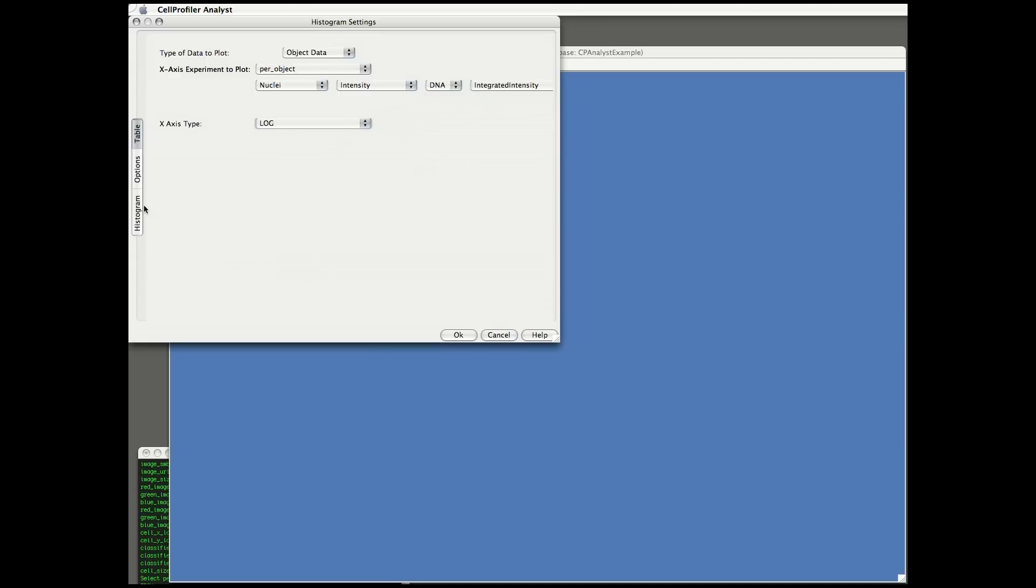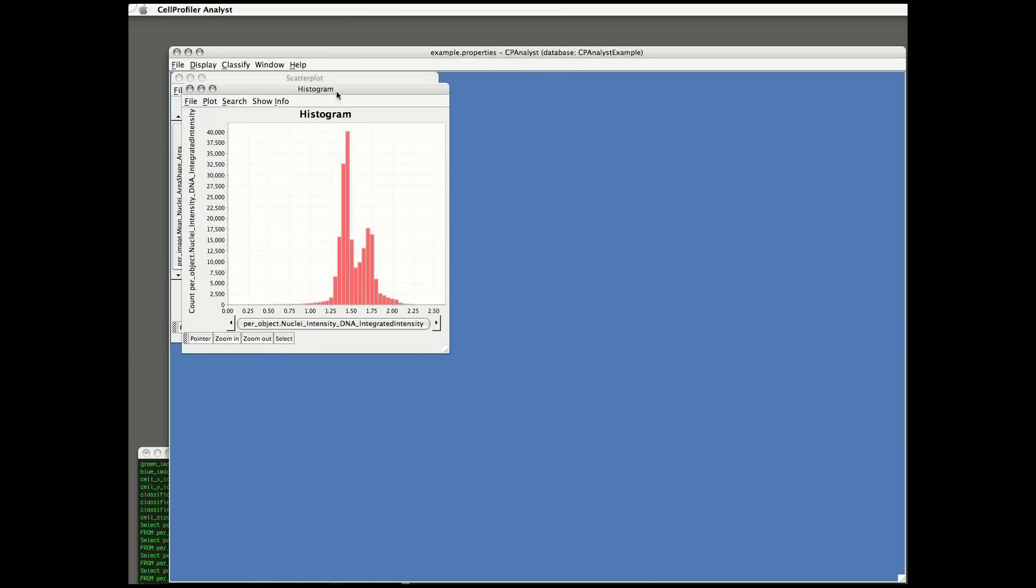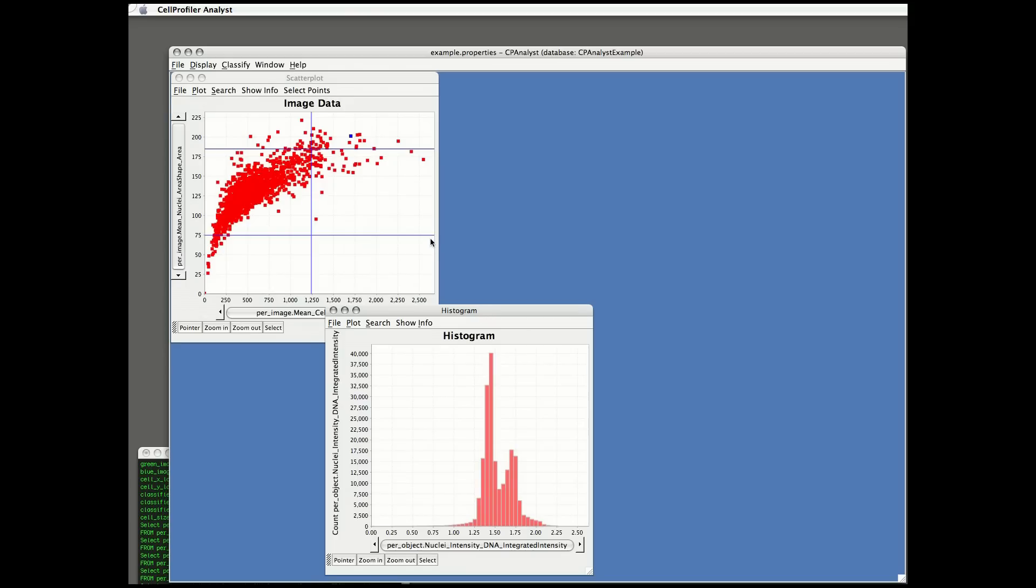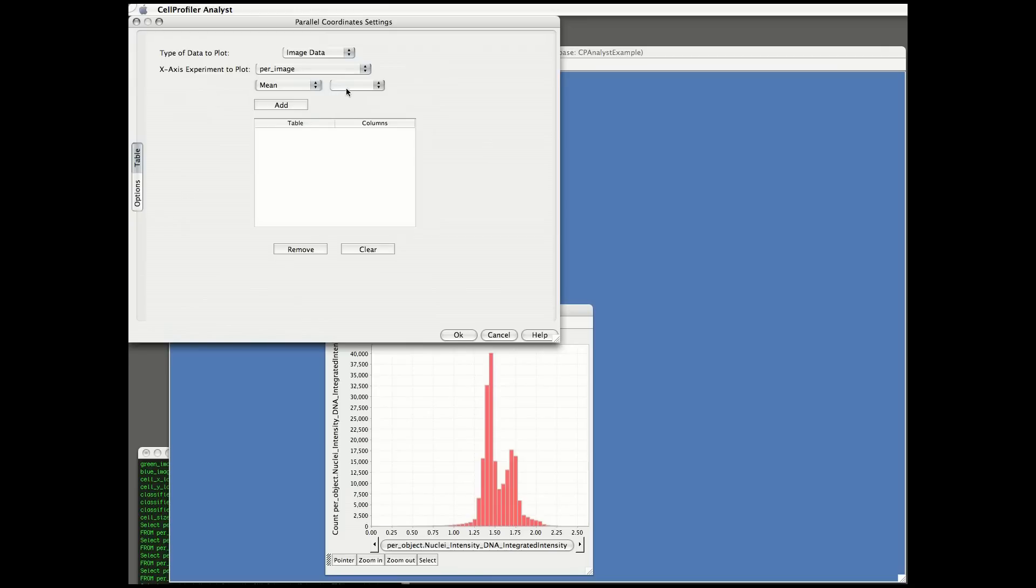For many plot types, there are options you can configure. Here, I'm adjusting the number of bins in the histogram. In this plot, the two peaks are representing the 2n DNA content on the left and 4n on the right. Remember, this is individual cell data, so all cells in the entire experiment, no matter what image they come from, are combined in this one plot.